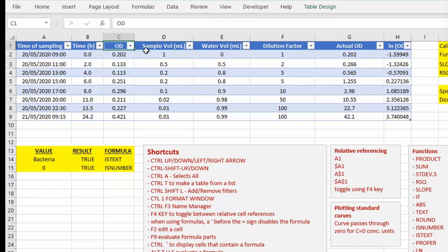And then OD measurements and sample volume, because whenever you take a sample, you dilute the sample to read the absorbance in the spectrophotometer. I don't know for bacteria, but for yeast, I always dilute when the reading goes above 0.4. So you can actually say how much volume you take with the micropipette, say 0.5, and how much volume you topped it up with for a final volume. So every step, you can actually write it down.